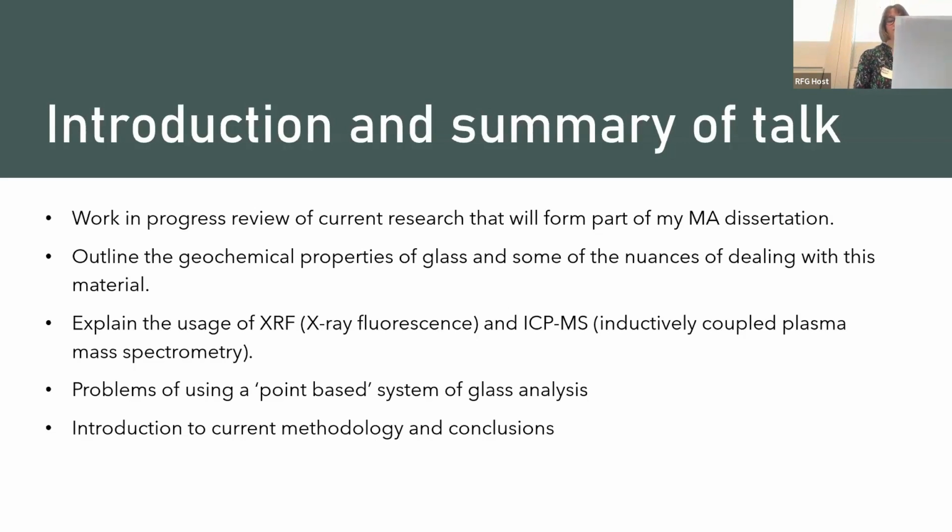study into glass consumption in fort/extramural settlement complexes in northern Roman Britain. This will hope to shed light on the possibility of the use of glass as a proxy to highlight any variations in wealth across forts and extramural settlements, and how these shift over time with the changing usage of forts and extramural settlements. With this in mind, this paper will focus on the sampling and preparation methodology I will be using in this study, and how these techniques have the potential for providing high-quality results.